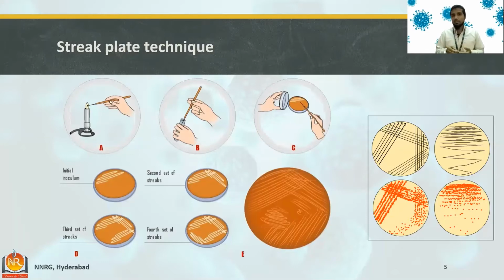It shouldn't be disturbed even a small bit, because if it is disturbed, the bacteria will go below the nutrient medium, and it may not grow there. So it is a must that the one who is inoculating the culture media should be very careful. And after inoculating, they have to incubate it, either for 24 hours or 48 hours. It depends on the type of microorganism which we are culturing.